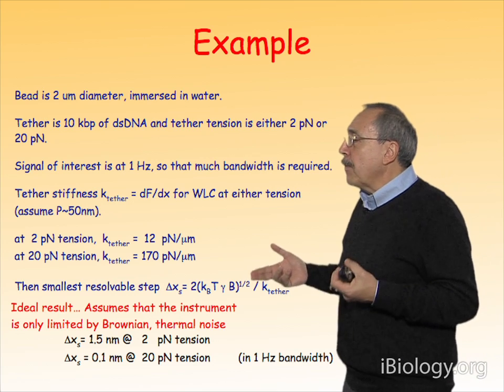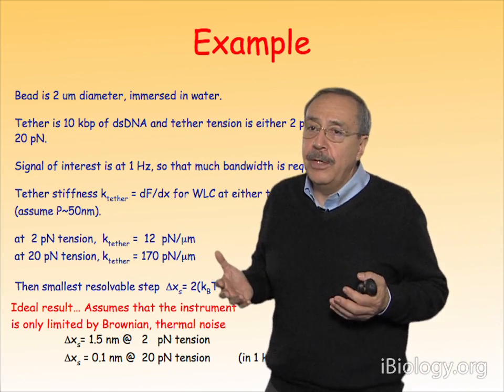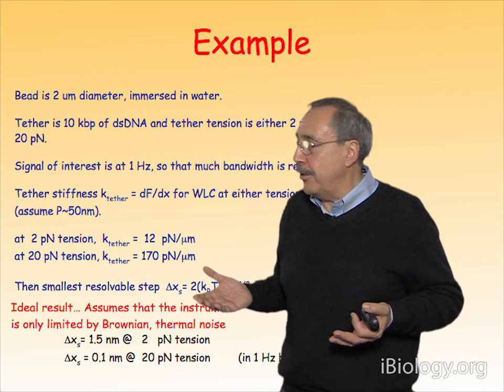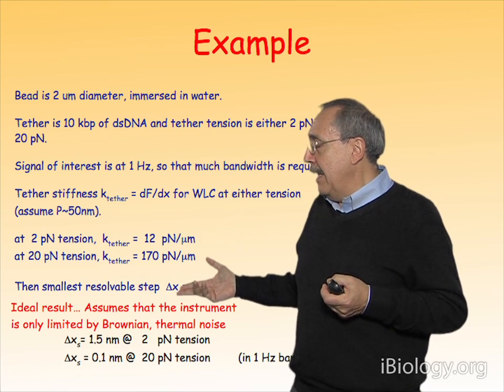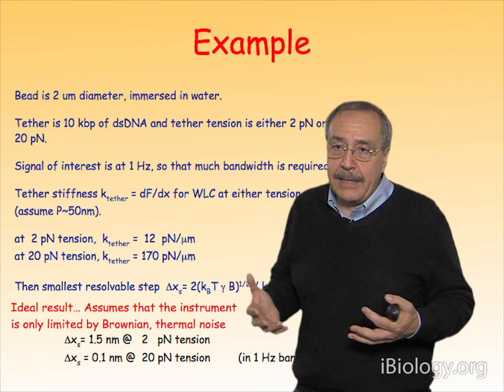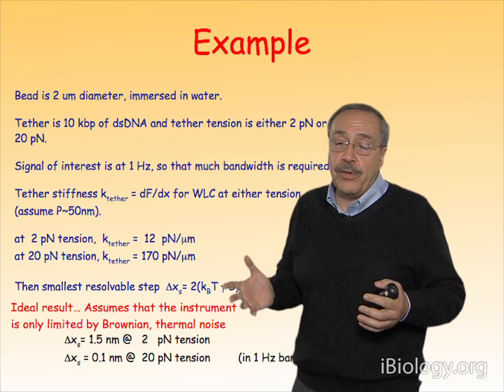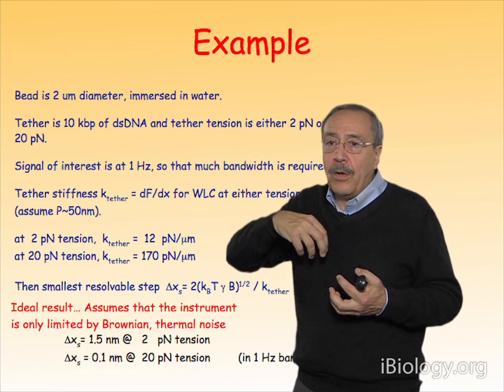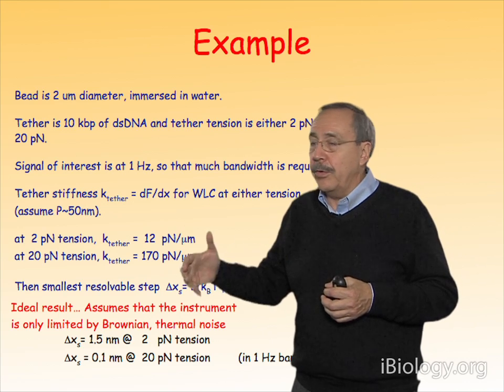So, in fact, optical tweezers are really wonderful instruments in the sense that they allow you to study molecular dynamic processes at high resolution, at reasonable temporal resolution, and at displacements and resolutions that are of the order important in biological processes: conformational changes, movements of one part of the molecule relative to another, or just changes in the position of a motor on a track.